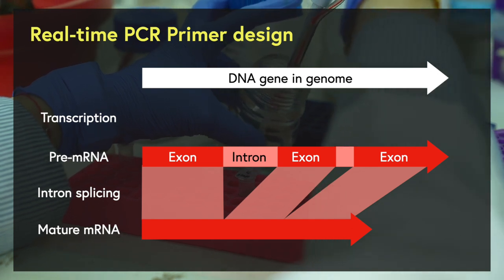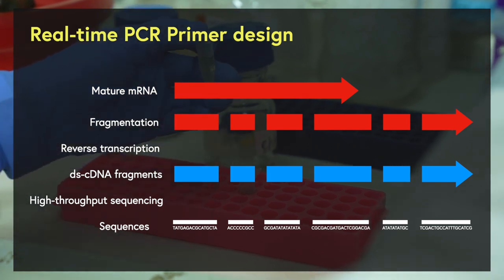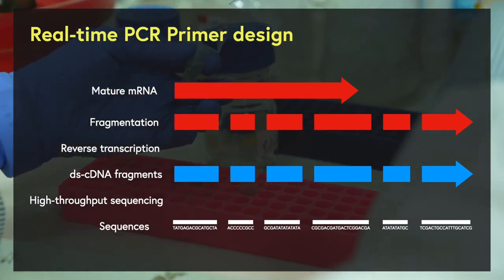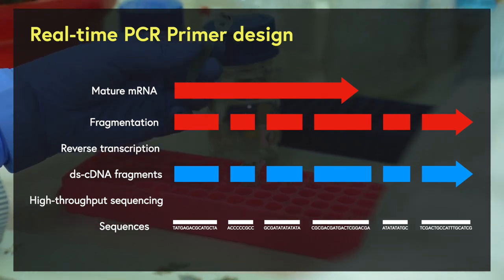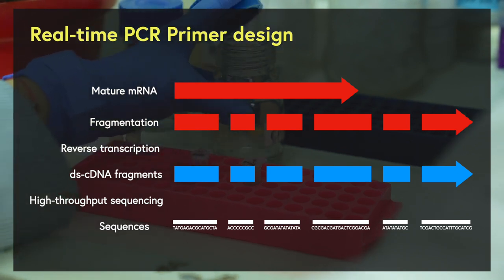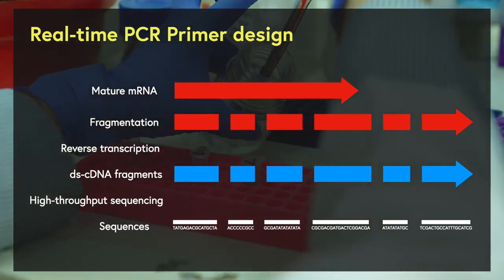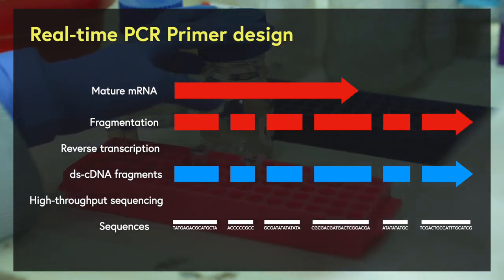And then when we extract RNA from the cells, we will only extract the mature ones and then do the reverse transcription, which means that your mature mRNA and the cDNA synthesized from it will contain no introns inside, compared to the intron in the chromosome DNA.